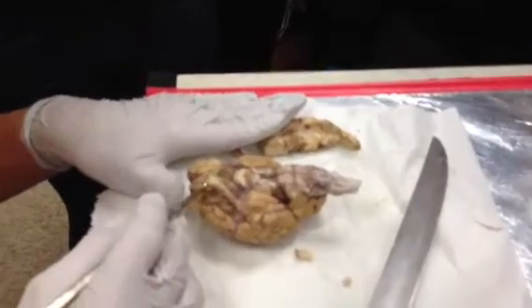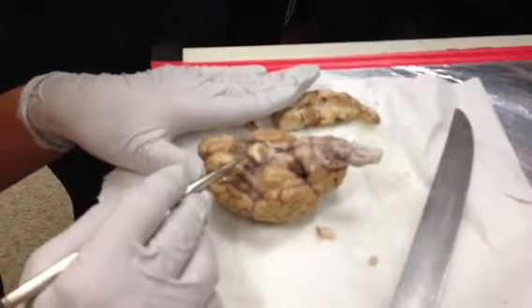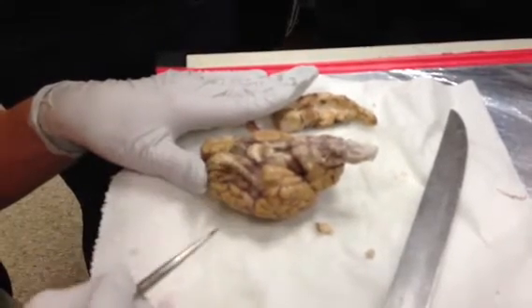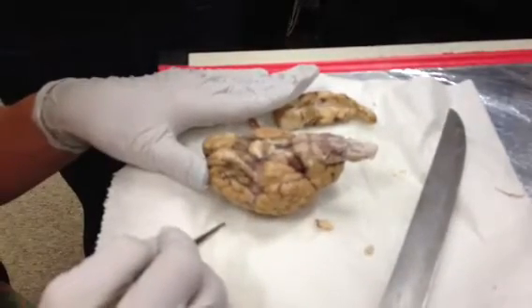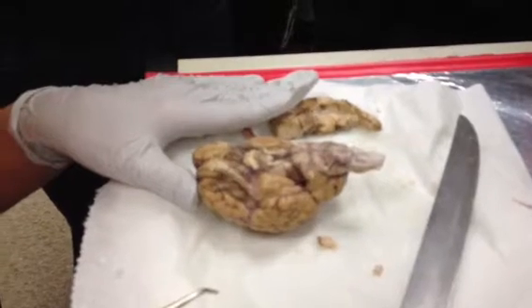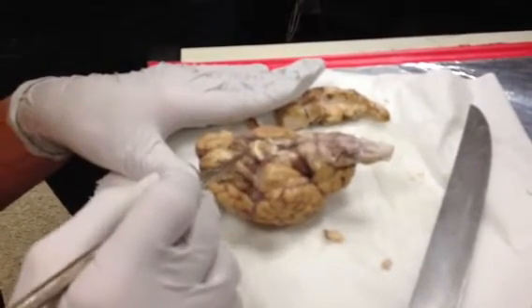So, here is our olfactory bulb, olfactory tract, optic nerve, optic chiasm, optic tract. This would be the infundibulum. You can actually see the hole for the pituitary and the hypothalamus to communicate. Then here is your mammillary body, motor movements associated with eating. Then here is your oculomotor, that's cranial nerve number 3. So we've got 1, 2, 3.